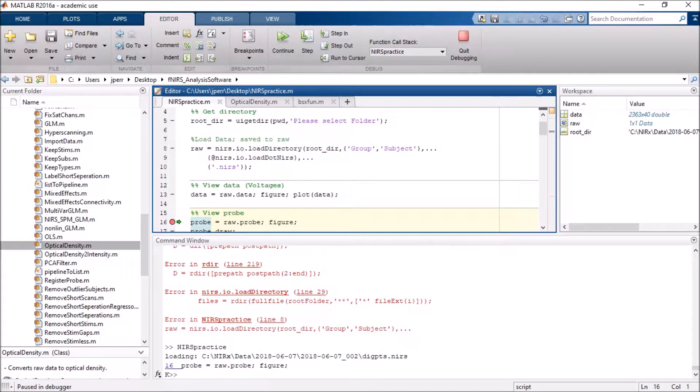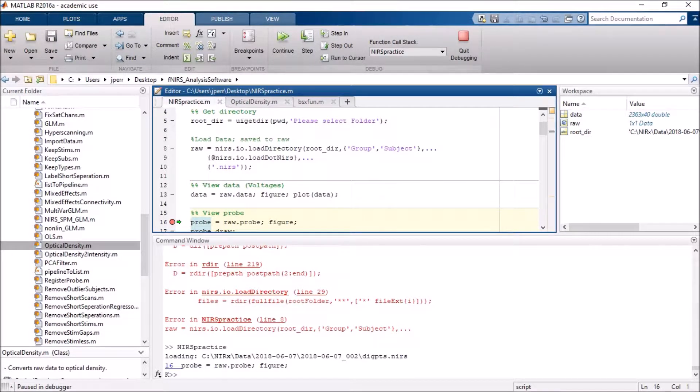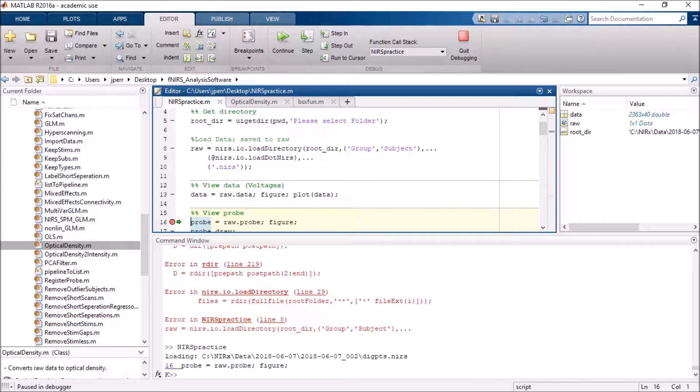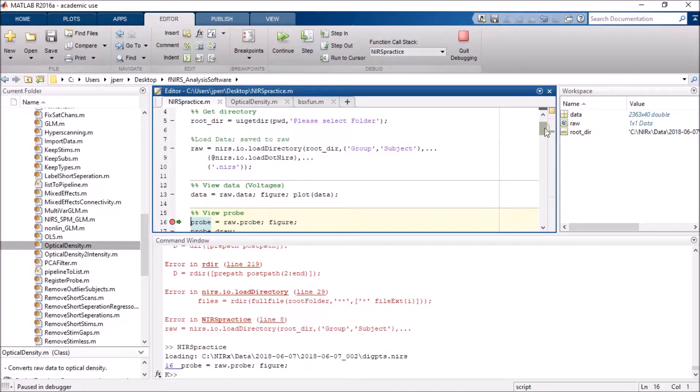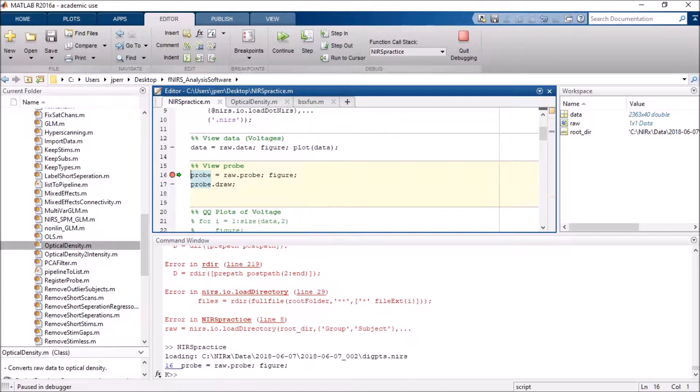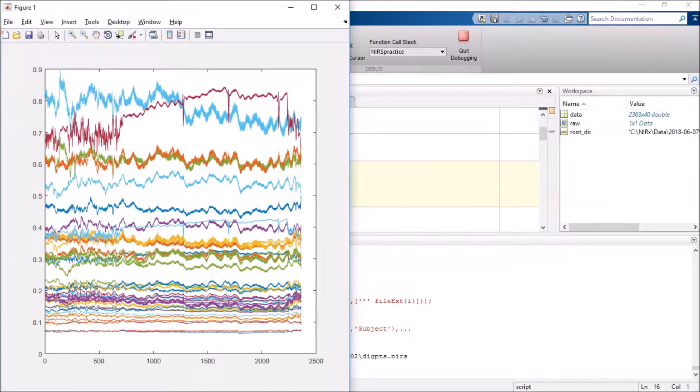So I've already translated my format to the .nirs format, and it's going to use the loadDotNirs function, and it's going to be looking for a .nirs file. From there I designated my data to be the raw data, I actually then plotted my data, which you will see here.